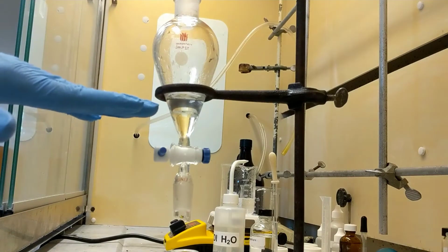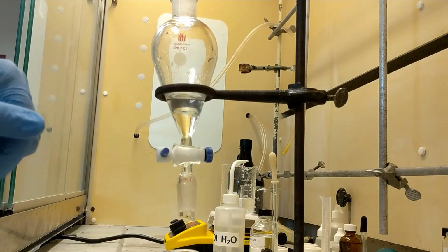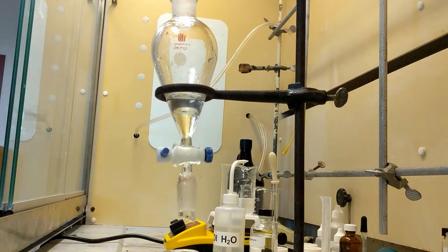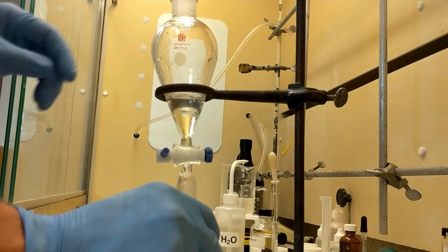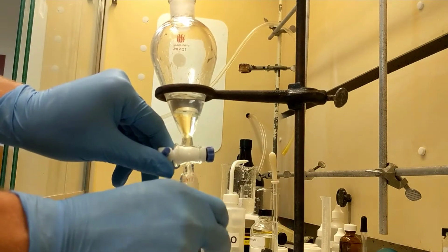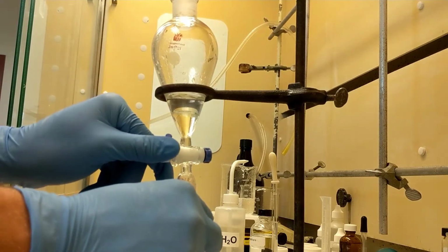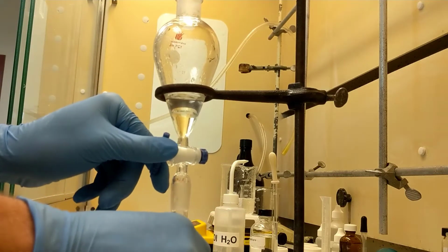So now I'm going to pull out this bottom layer. I'm going to pull it out, add some more methylene chloride, do it all over again, okay? So I'm just going to pull out this bottom layer of methylene chloride. So I'm going to open my valve.